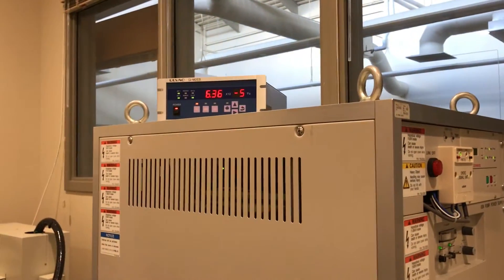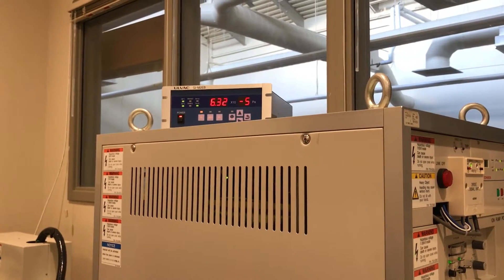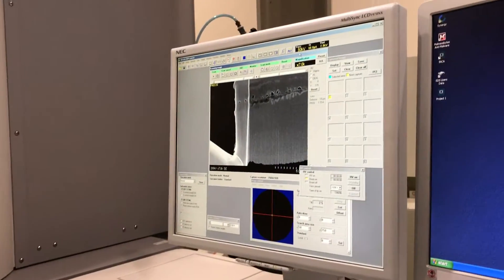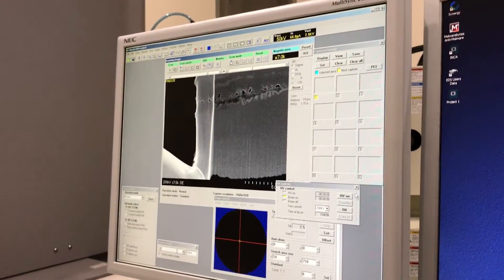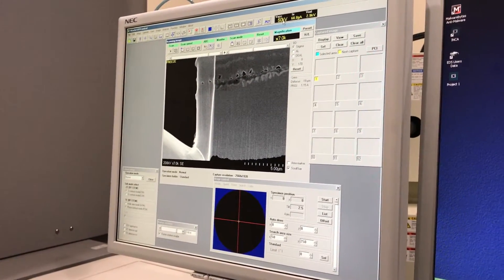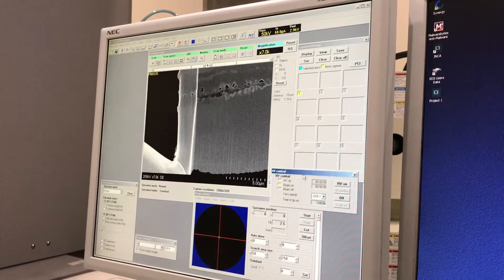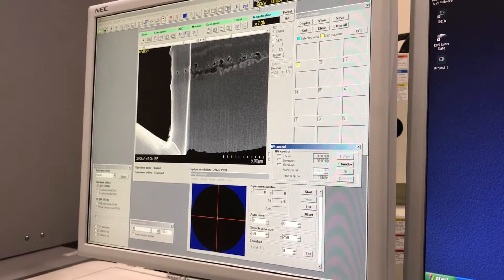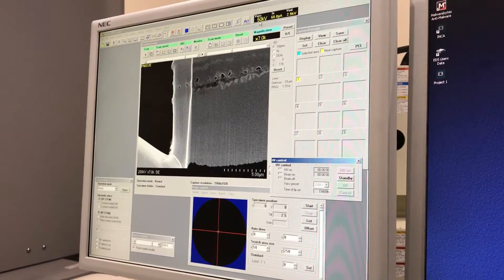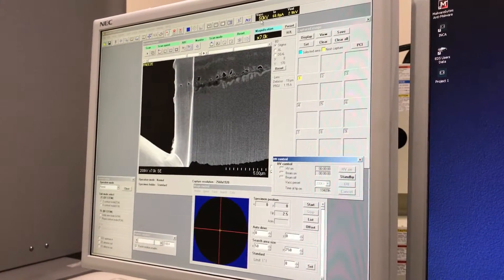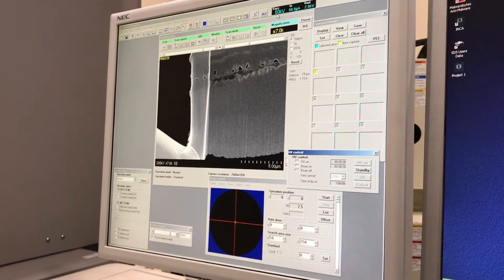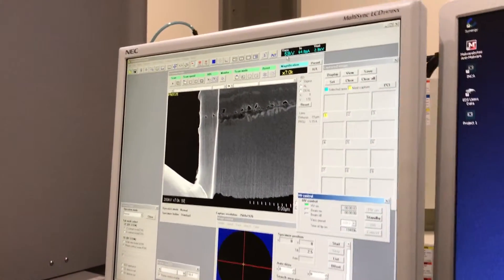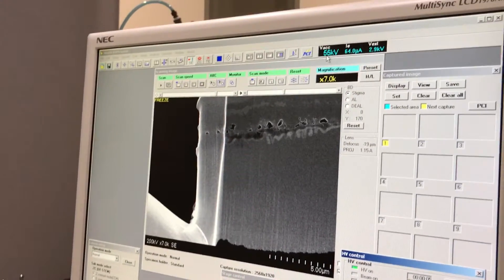While we are waiting for the pressure to be 5 × 10⁻⁵, we can turn on our beam here. Right now you can see the beam is 50 kV. Usually this microscope works on 200 kV. So you double-click here, this window will appear and put the HV on. You should see the kV increase after a while — it takes about 2 or 3 minutes to reach 200 kV. Now it's rising up.